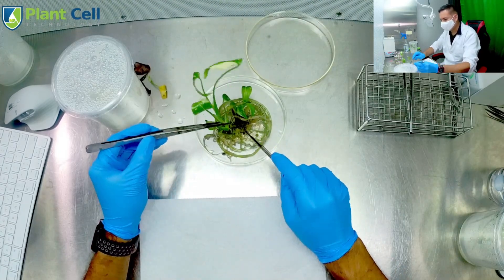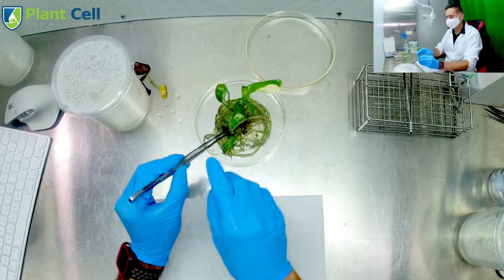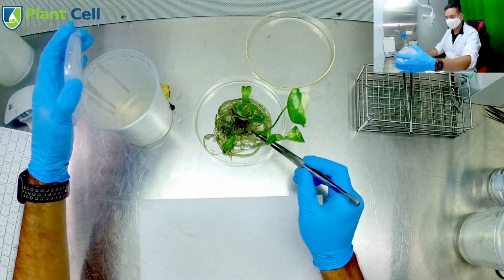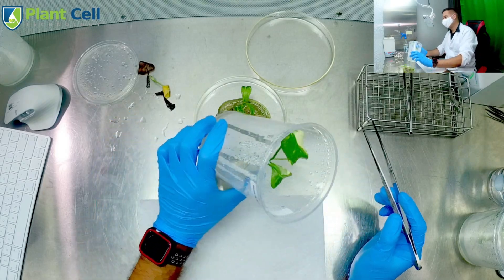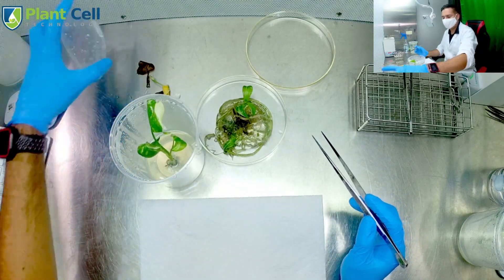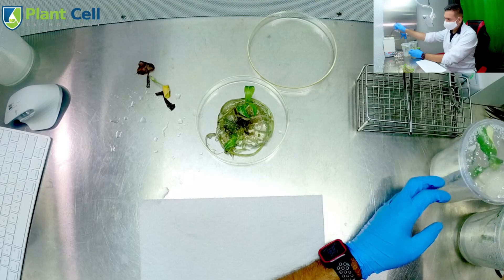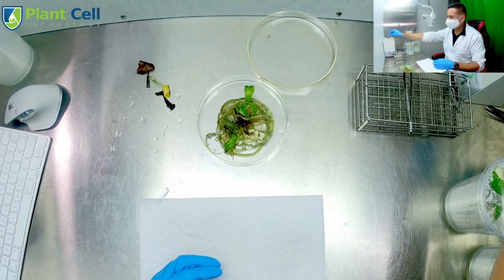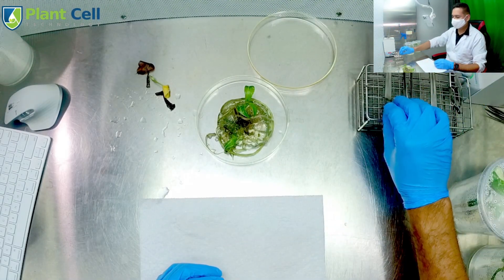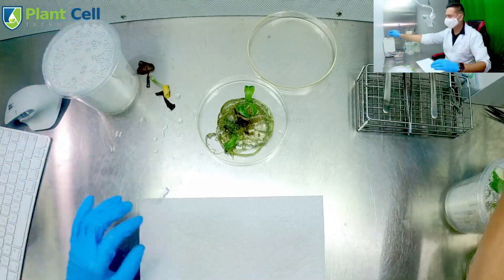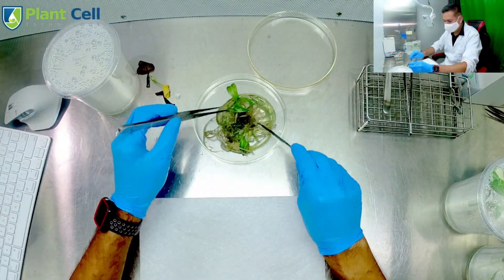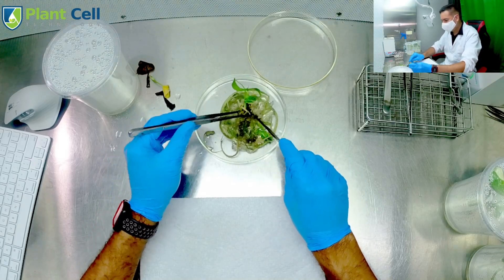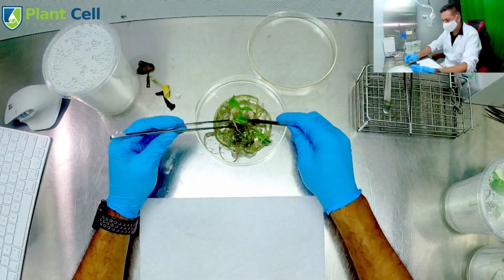And 1 milligram per liter of PPM. With that I'm hoping I will get a faster multiplication rate. However, I know I will get smaller plants. So depending on your situation, if you want to get more plants, then it's okay to test a higher concentration of BA.